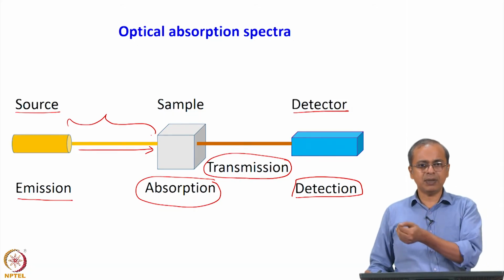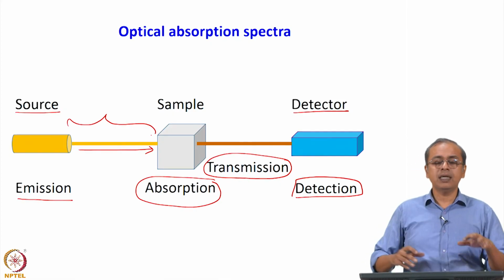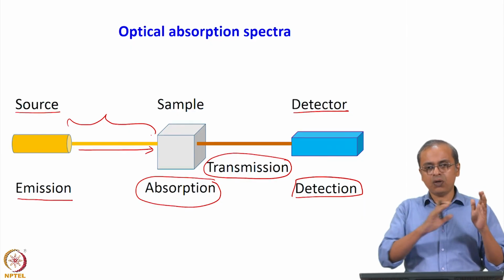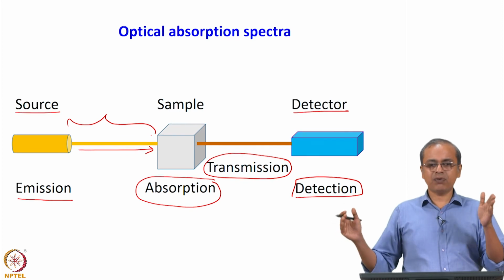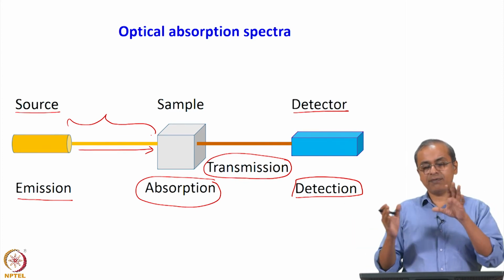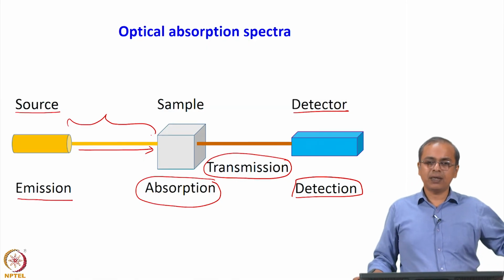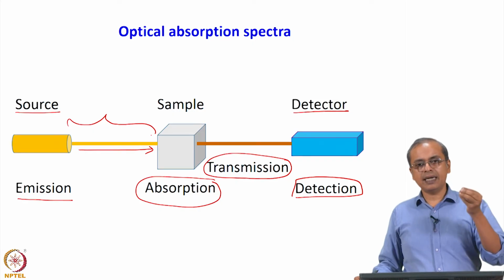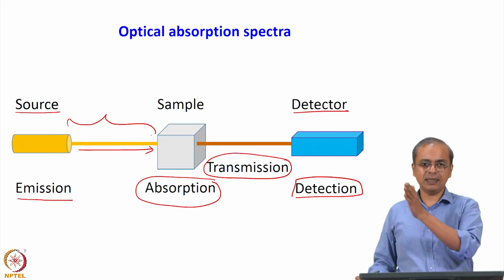So, you cannot at least assume that about the source. Just to correct for it, you put a known sample and you get the data from that known sample for the entire frequency range. If it is supposed to be mostly transparent in that range, then you have the data that corresponds to any variation from the source and any variation due to the path between the source and the sample and the detector.